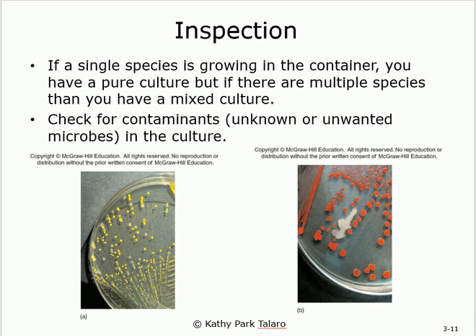What does that mean? It's contaminated. Like I mentioned, the tools that you're using, you're supposed to sterilize. So I take that Staphylococcus epidermidis, I put it in the nutrients, and I'm looking at it, I see two. You put one, or it comes from the air or something. So if you are using a pure culture, you're supposed to see one species only. If you find more than that, translation, contamination. It's contaminated somehow.